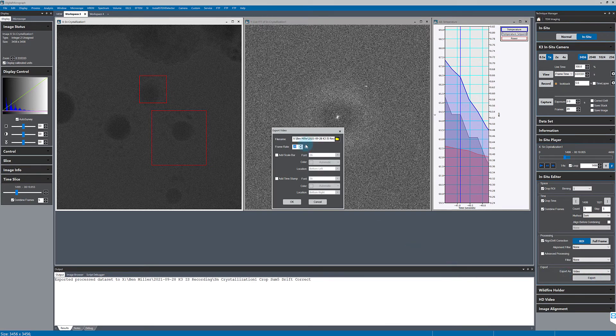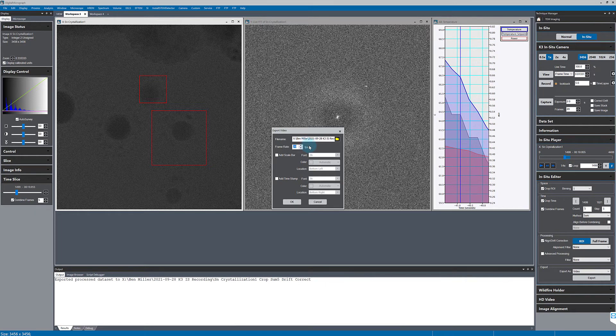In the IS editor now I can choose the frame rate and add a timestamp or a scale bar if I want.